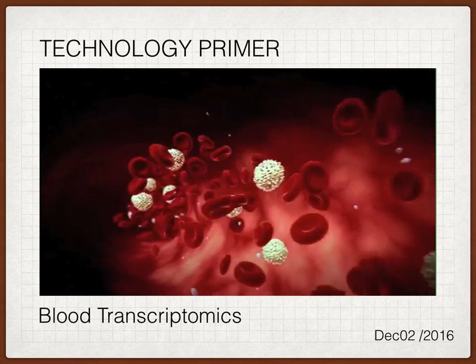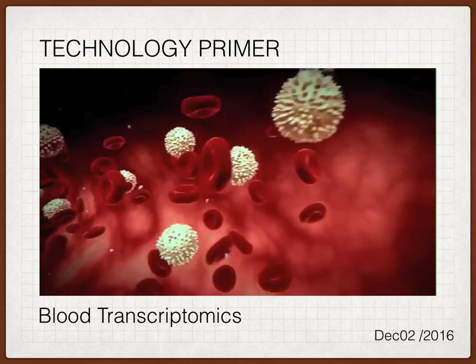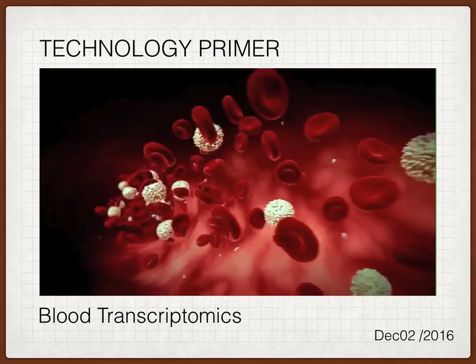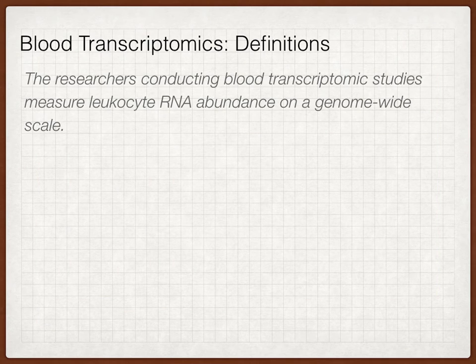This technology primer is about blood transcriptomics. The researchers conducting blood transcriptomic studies measure leukocyte RNA abundance on a genome-wide scale.